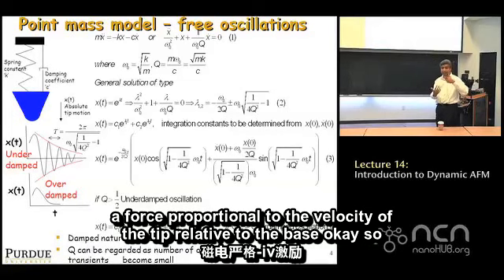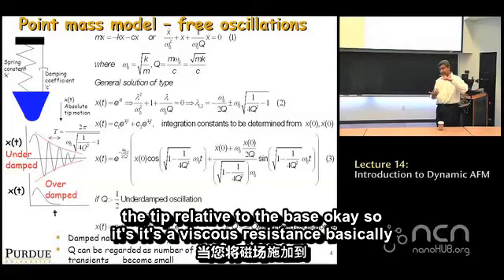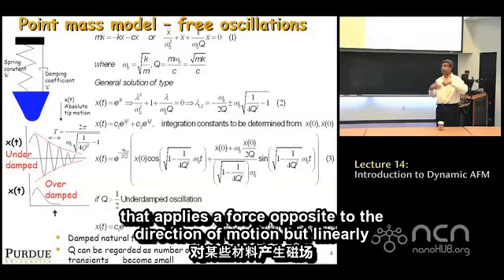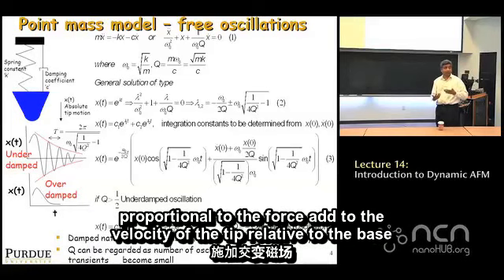So it's a viscous resistance that applies a force opposite to the direction of motion, but linearly proportional to the velocity of the tip relative to the base.